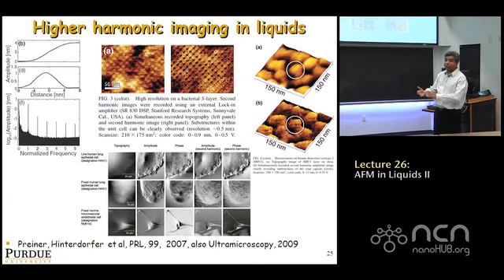I'm sure this group is so good at these things. I'm sure the scaling, if you look at the scaling, even though you see the contrast in amplitude, it's actually very little variation in amplitude. I'm sure the controllers are all set properly, but it's just an observation I'm making to you that when you do your things, you should be careful about it.